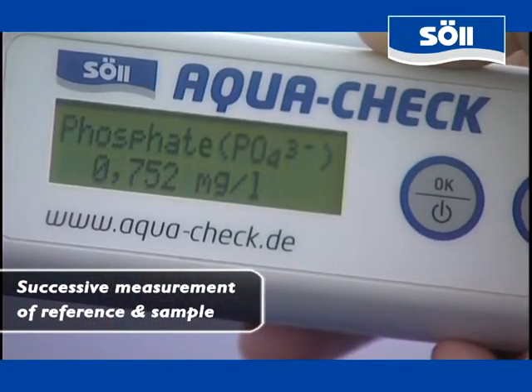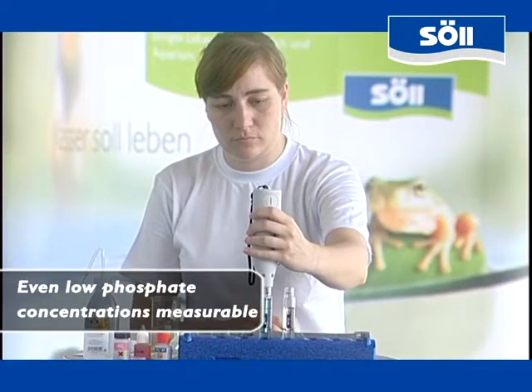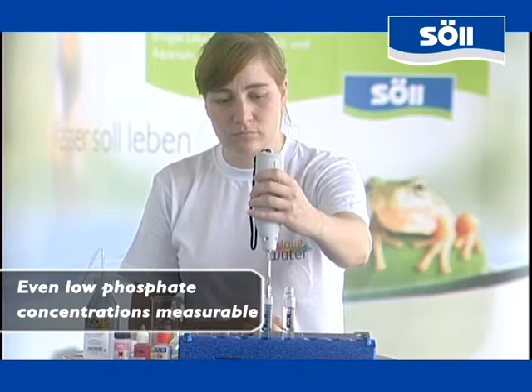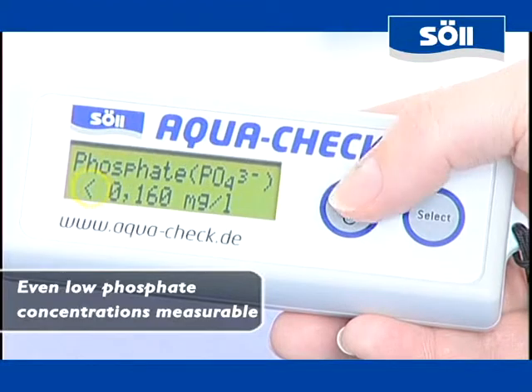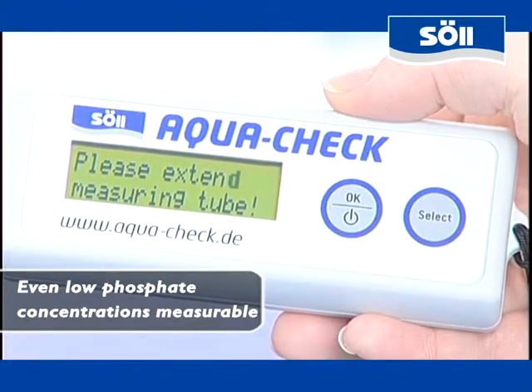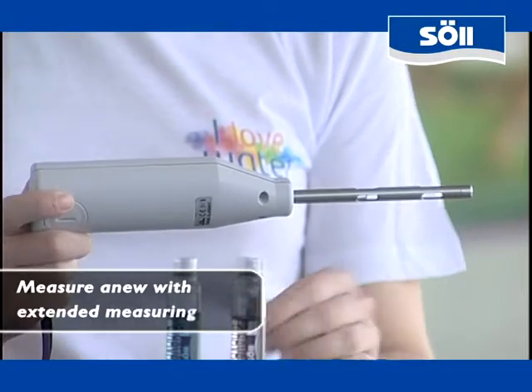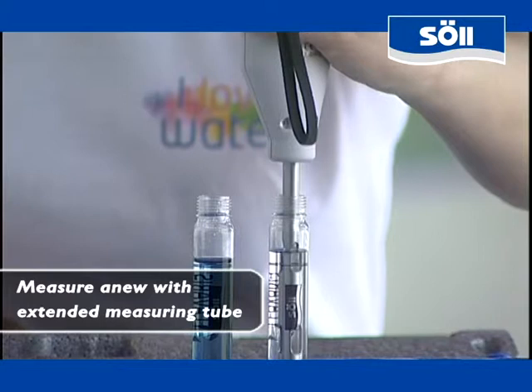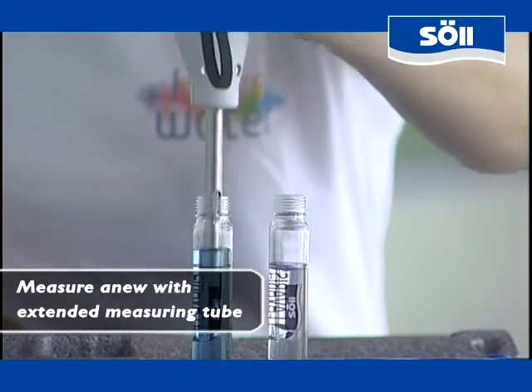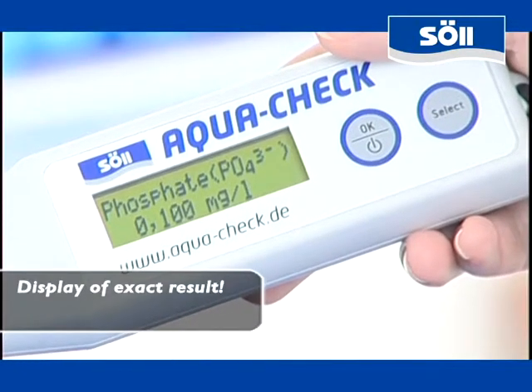In many waters phosphate occurs in trace amounts. Due to a special characteristic, AquaCheck can detect even low concentrations of phosphate without any difficulties. When the phosphate concentration is lower than 0.16 mg per liter, a less-than sign is being displayed. After confirming this display, the device asks you to pull out the measuring tube. Now you have to carry out the measuring process once more. Thanks to this mechanical feature, the lower limit of the measuring range for phosphate is 0.01 mg per liter.